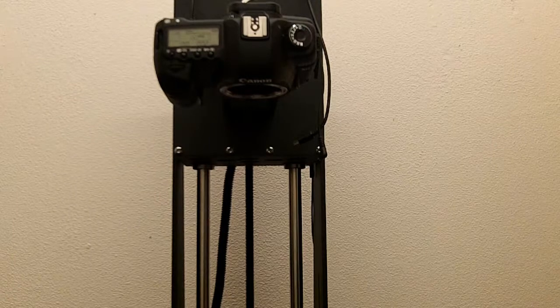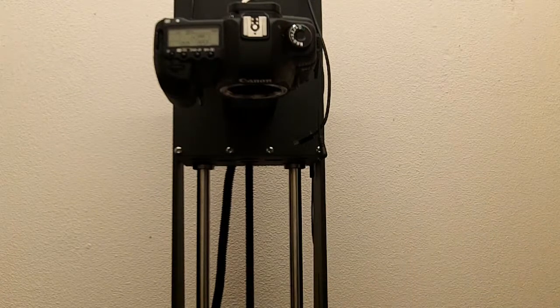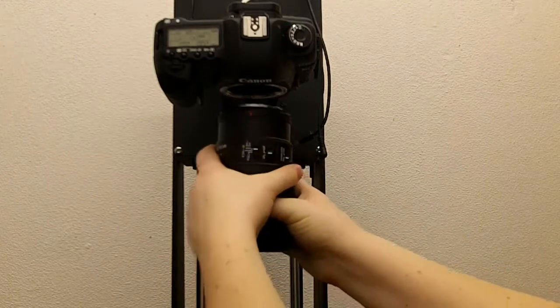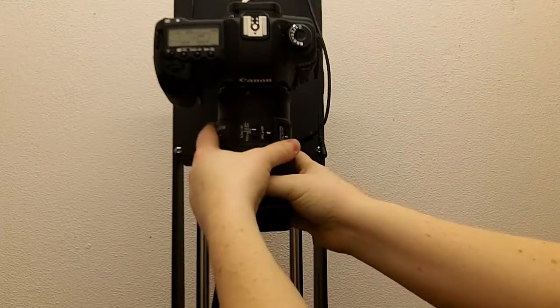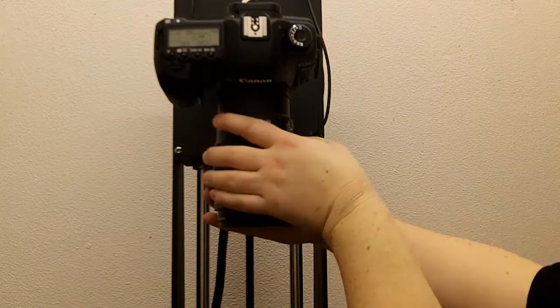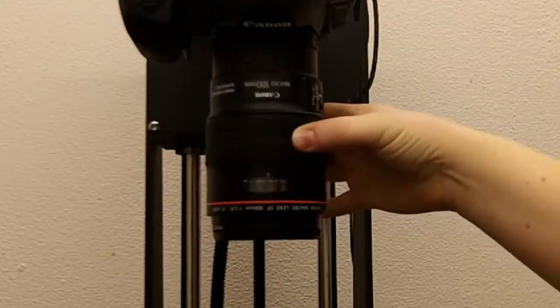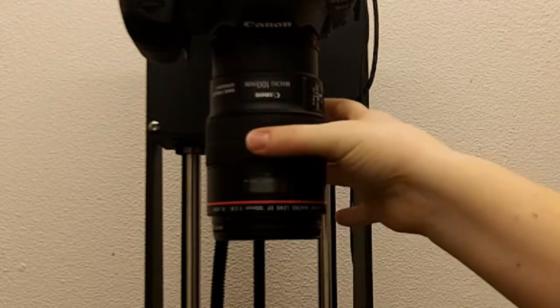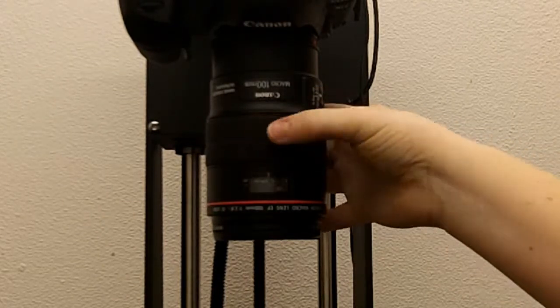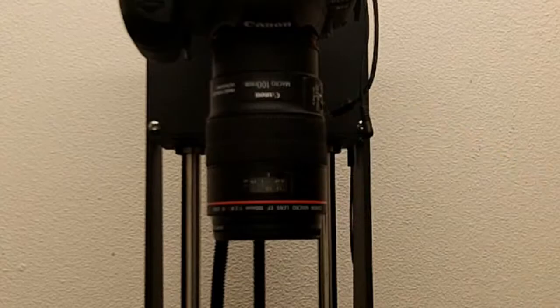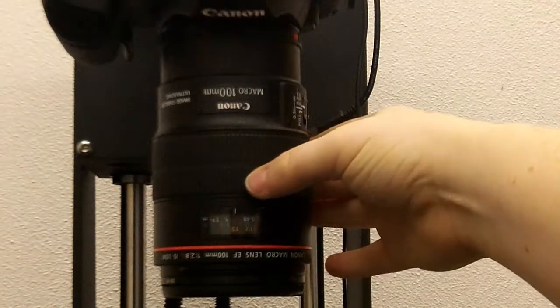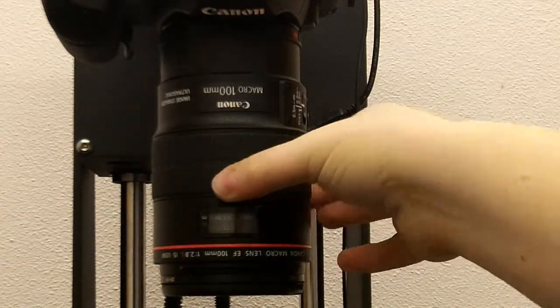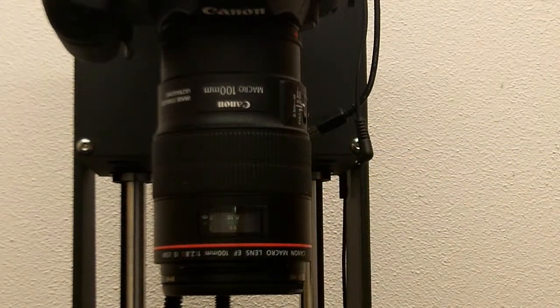So, let's start with the 100mm lens. This is an often used lens for smaller specimens. Attach the lens, and then you can change the magnification by turning the dial on the lens. So, here's the lowest magnification, 1-5, and then all the way to 1-1, which is the highest magnification.